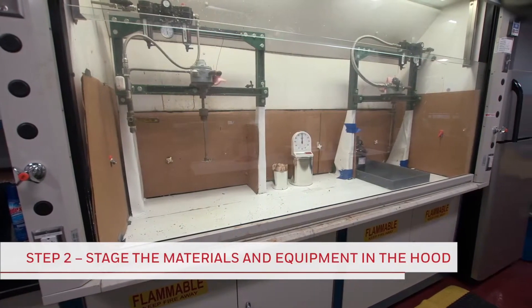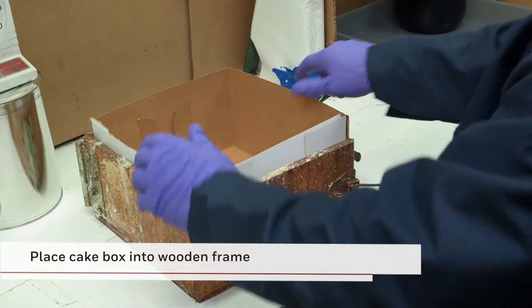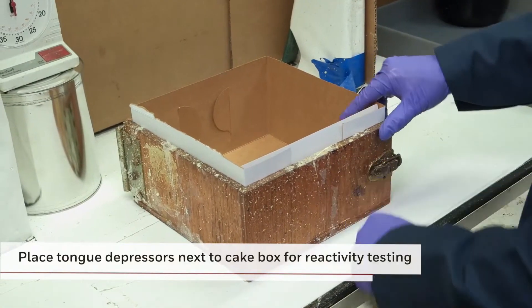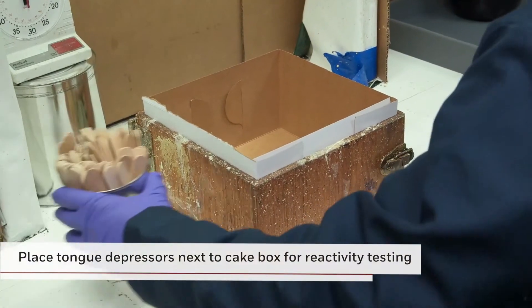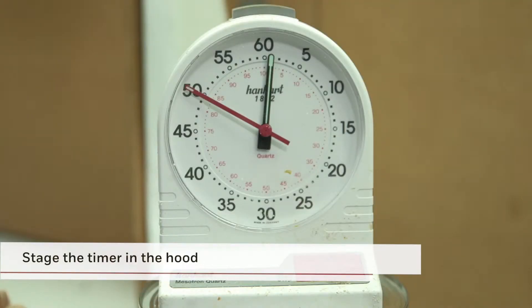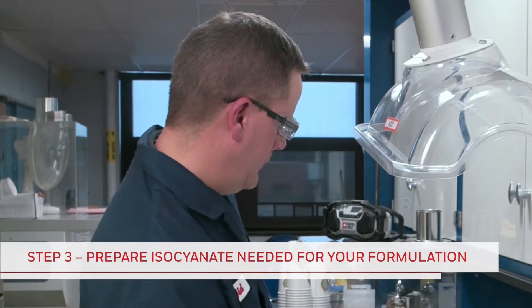Next, you can stage the equipment and materials in the hood for foam making. First, place the cake box with top removed into the cake box frame. Next, place the tongue depressors next to the cake box for reactivity testing. Stage the timer in the hood so it's ready when you prepare the isocyanate using the wet tear method. Prepare the appropriate amount of isocyanate needed for your formulation.